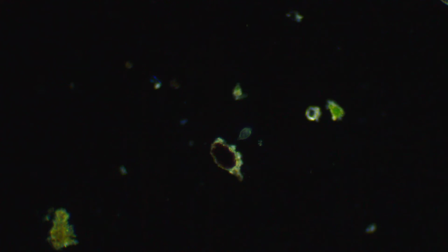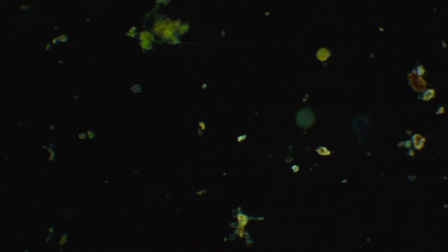Alright, let's move on then. We'll keep looking around and see what we can find here. I almost missed that guy though, but see, I'm starting to recognize them. They look like little flowers just hanging off of a piece of moss. It's pretty interesting.